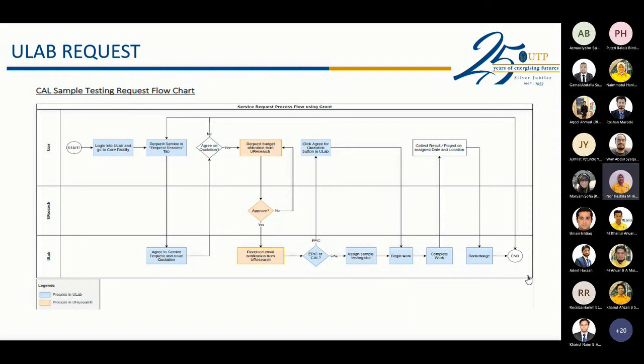So you can choose like 5 to 10 compounds, as long as all the peaks in your result XRD pattern are identified with the structure data from the database.